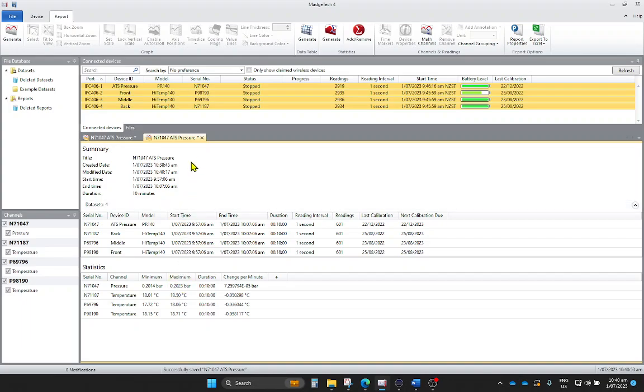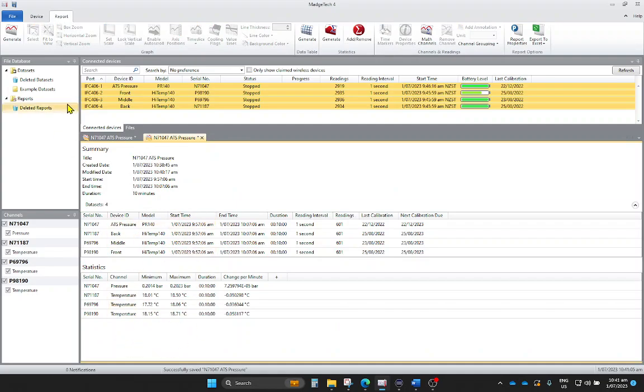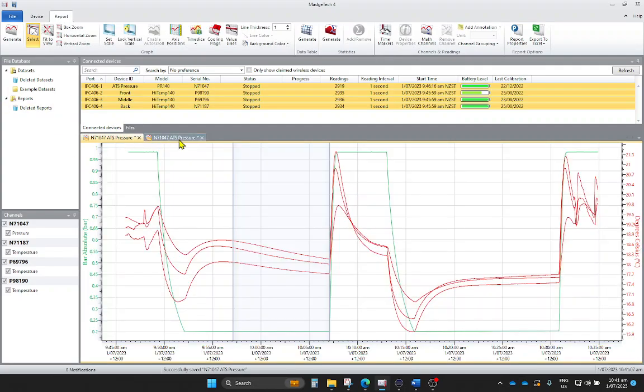Okay, so again, these statistics aren't saved. I wouldn't necessarily save these unless you specifically wanted. They're always referencing this data here. So if you were to delete this data, this would be blank. So make sure when you do things, you save them into your network. Go from there. So what we could do is add a time marker.